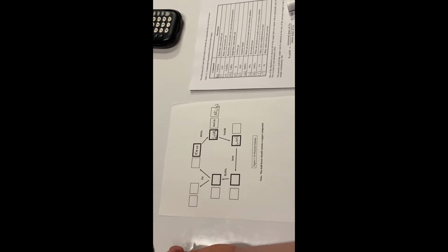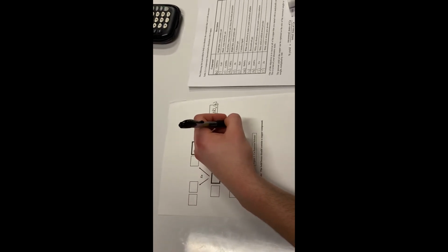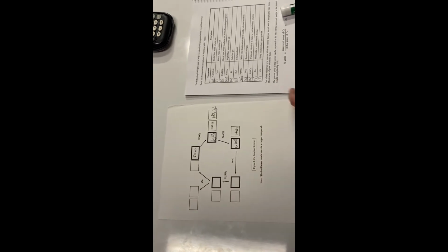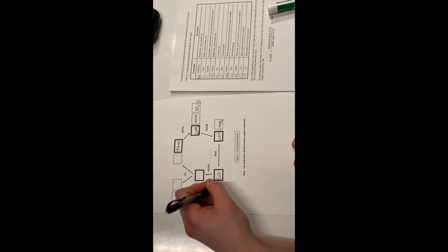Since sodium hydroxide was added, it produced copper hydroxide, which is a water-insoluble salt, with the salt being sodium nitrate. So in this box, we'll write sodium nitrate, NaNO3, which dissolves in water, yielding a colorless solution. The solution was then heated, turning to a black substance, with all of the salt floating to the bottom. In table 2.1 on page 8 of the lab manual, it appears that the reaction is now copper oxide, which is a black water-insoluble salt. So in the box, you'll write CuO, which is copper oxide, and there's H2O, which is a liquid in the solution as well.